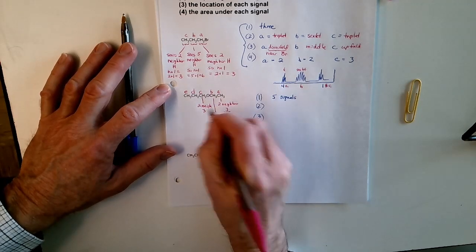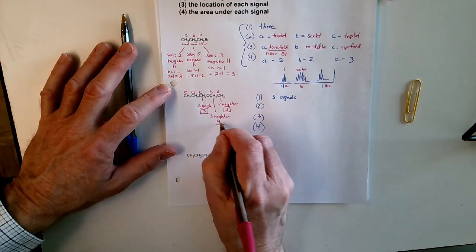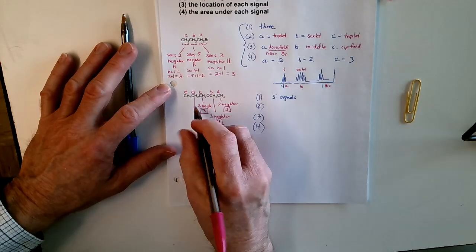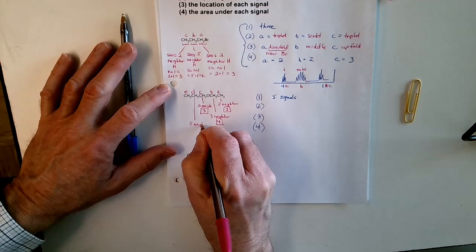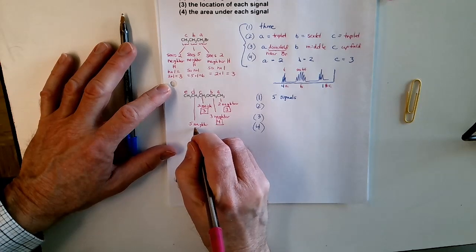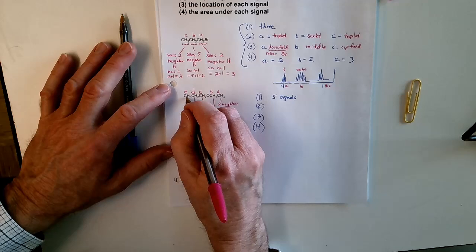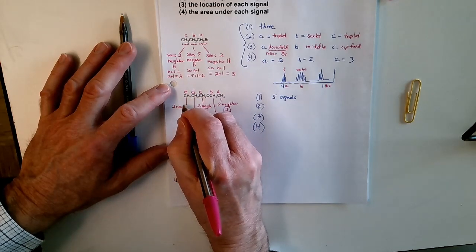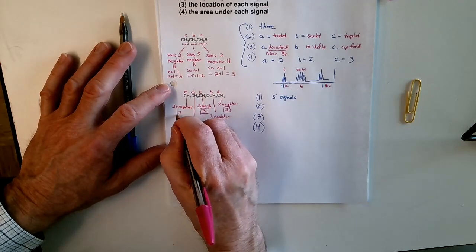It's split into 3. I should be boxing these. And almost done here. This last one sees 5 neighbors. That means you expect it to be split into 6 lines, and the last one sees 2 neighbors, so you expect it to be split into 3 lines.